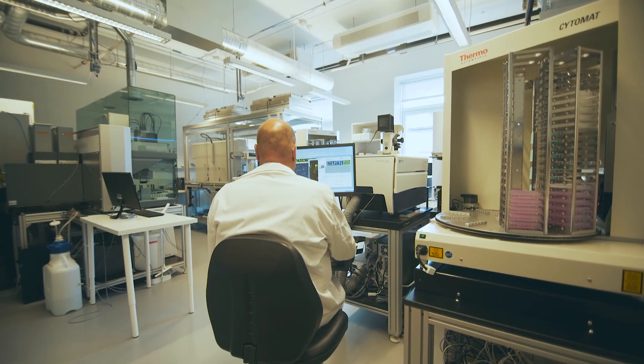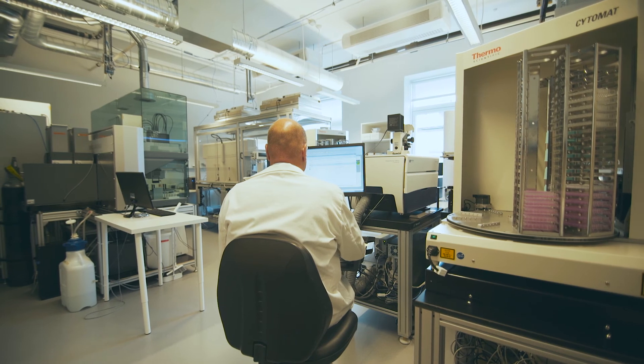Timing is very important in cell culture. Sammi Schedulink software can manage your automated cell culture workflow in a timely manner, making sure that each plate is treated in the same manner.